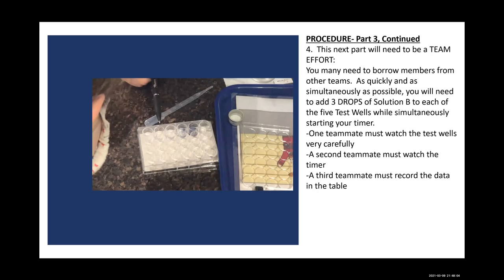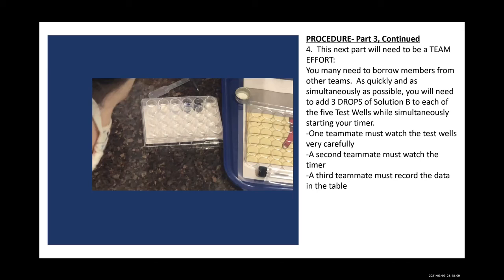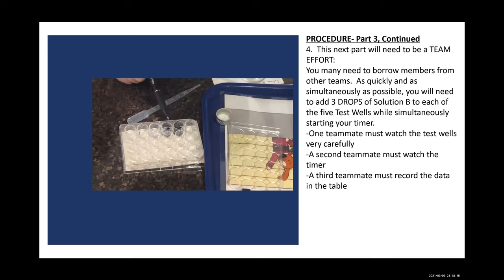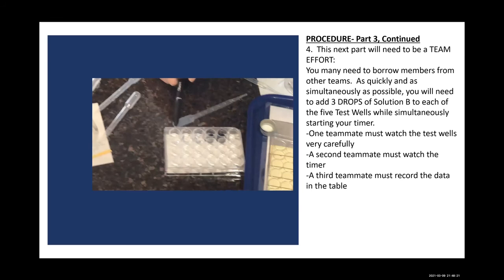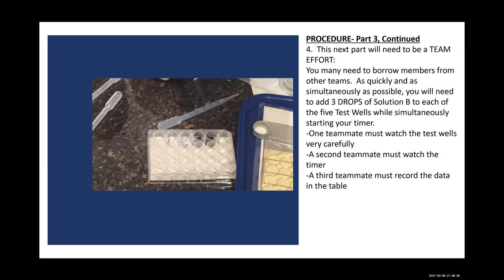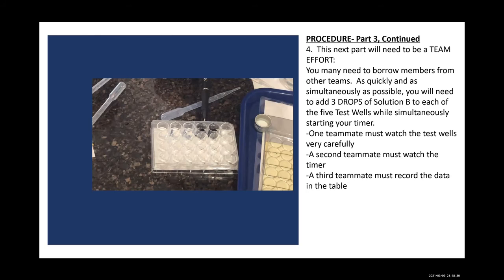All right, 18. Time? 33, going first is black. Yep, number 1 is black on 33. Is number 2 black? Not quite yet. 21 it is. Yeah, it's not yet. Still nothing in number 1. Not number 1, we're in number 5. 53 seconds now. 53, 55. It's almost a minute.